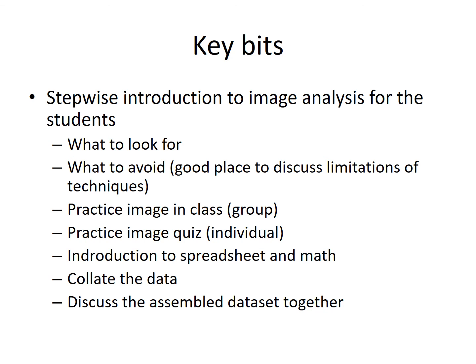Okay, so that's my description of the image analysis project that I designed in a panic for microbial physiology, but it is something I intend to continue even if I don't teach that class again remotely, and hopefully there's all kinds of projects that one could do with image analysis with the students. The great thing about GIMP is that it's pretty easy. I didn't have any problems with students being unable to use it to do the measurements I described, and it's also free. So all good traits.